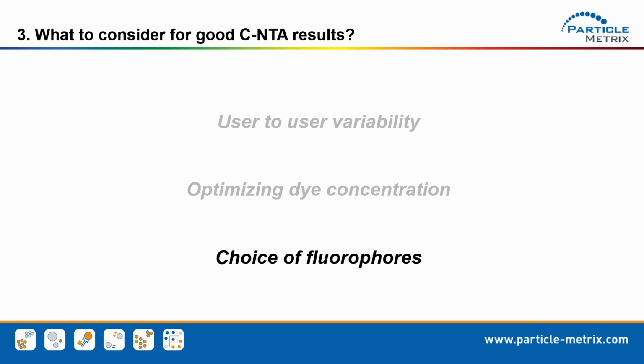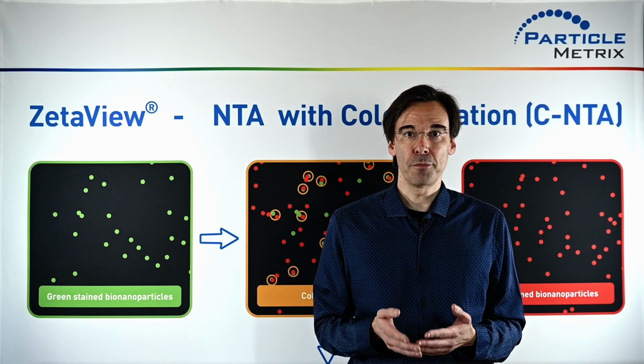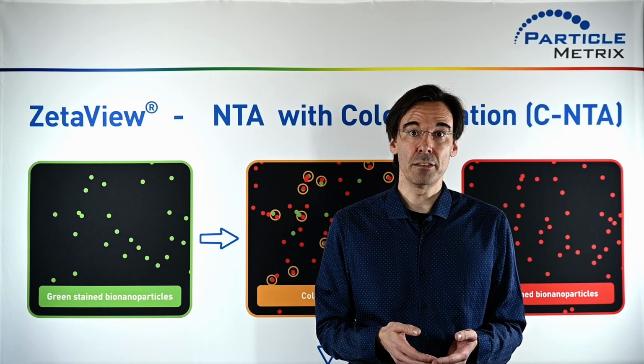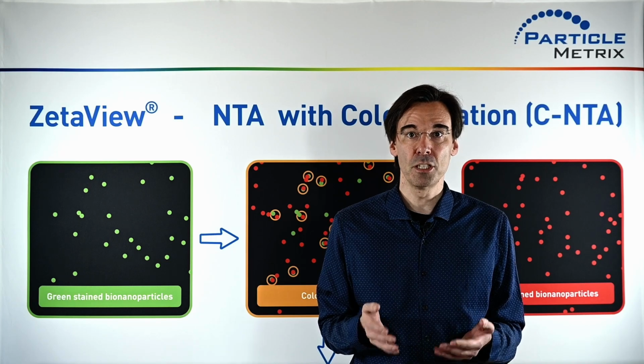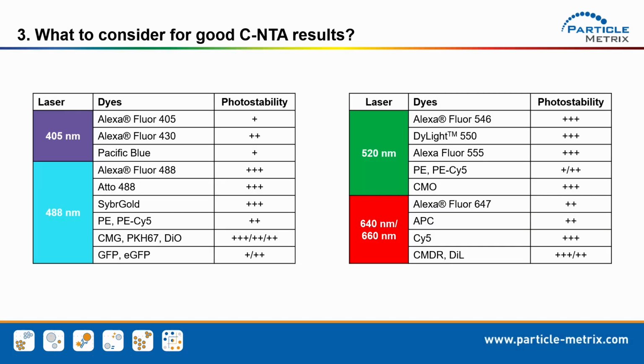Last but not least, choice of fluorophores. When using a combination of different fluorophores, carryover from one to the other fluorescence channel needs to be taken into account, and like in flow cytometry, the spillover effect needs to be corrected. The best way, however, to avoid spillover is to use combinations of fluorophores whose Stokes shifts are far enough apart. Furthermore, you should prefer bright and stable fluorophores.